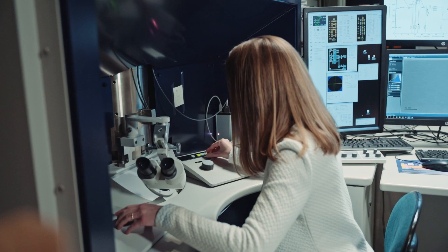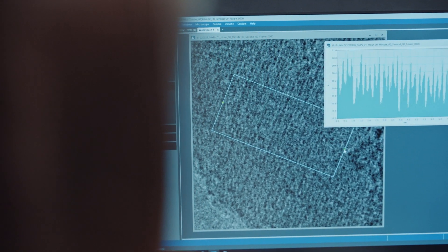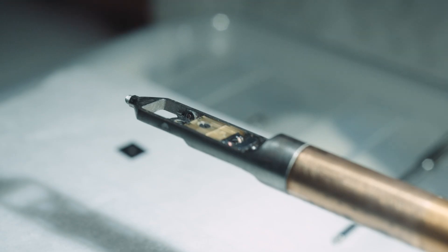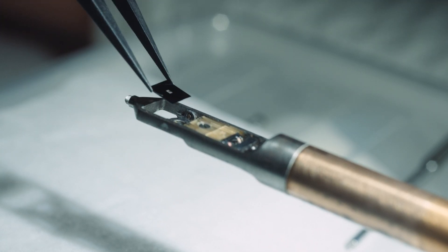Now Kimberly will expose atoms to heat and gases and then film it with her microscope. So here we have a microchip with some nickel nanoparticles. I'm going to go load this into the sample holder and we'll put it into the microscope.